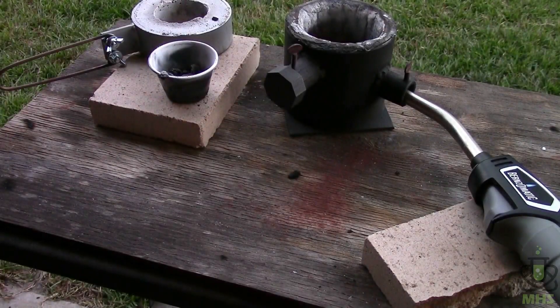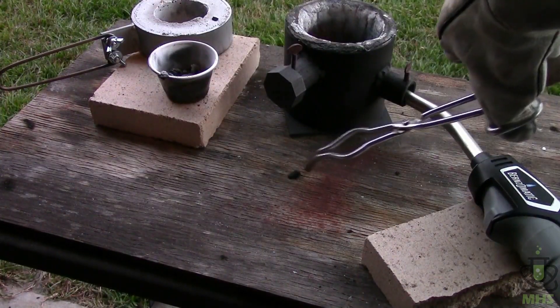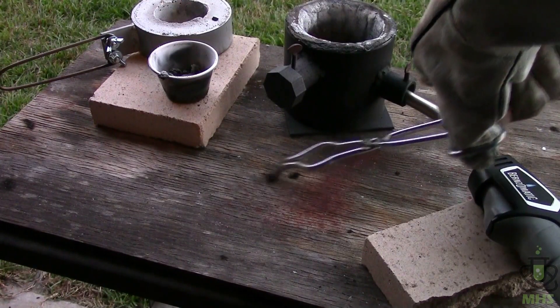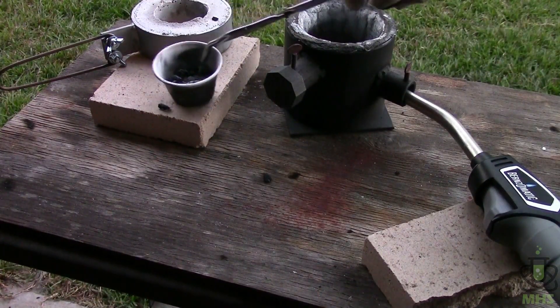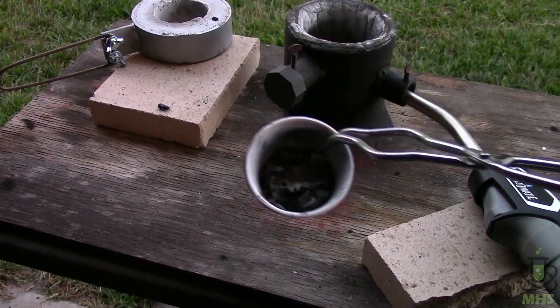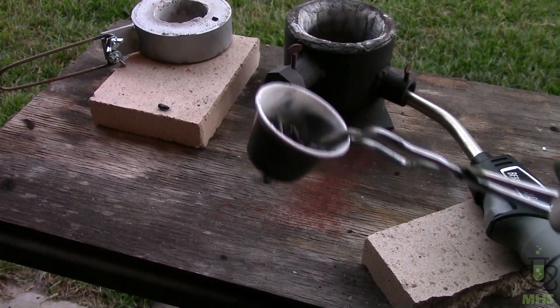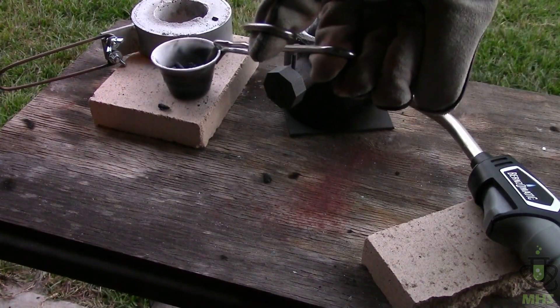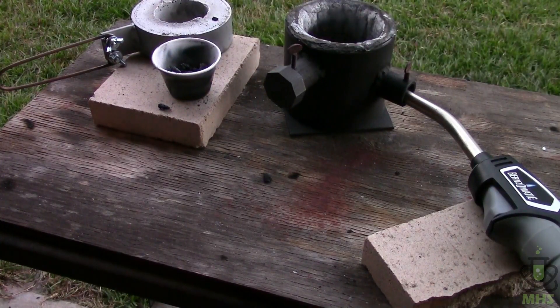It looks like that worked — you can see it threw boron all over the place. There are scorch marks all over the table and here's a chunk of ejecta. In the crucible we've got a black material at the bottom and a bunch of white stuff around the rim, which is definitely magnesium oxide from burning magnesium. The black material should be a mixture of boron and magnesium borides.